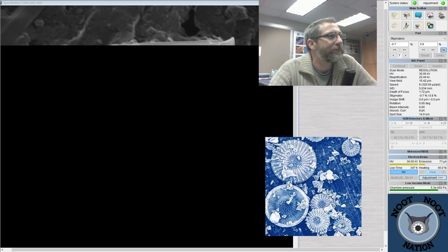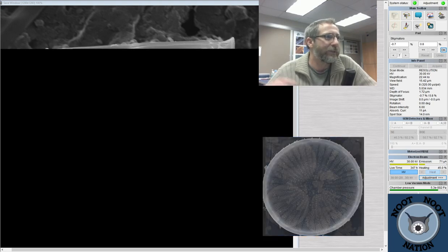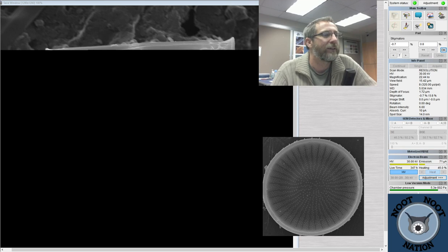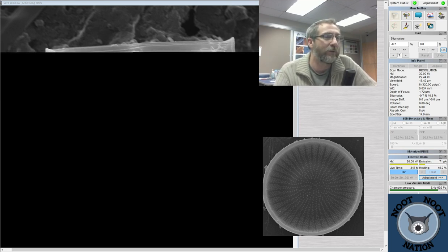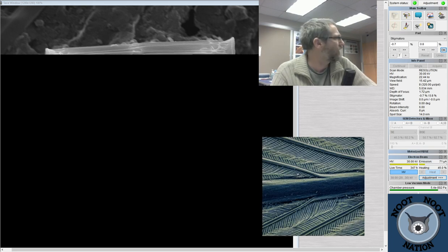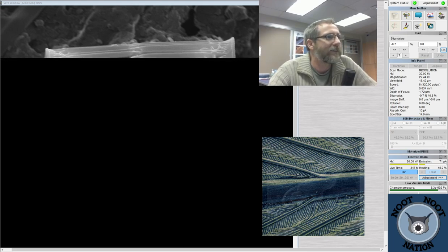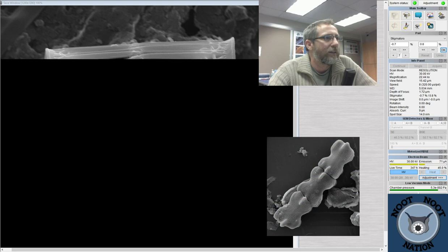Yeah, on the mail. Do you use gold to coat? Yes, I do. You carbon coat thin sections, because you don't want the gold contamination. Yeah. So when we're doing ours, if we're doing something that has gold in it, we sputter coat it with silver. I don't think that my sputter coater will do carbon coating, but you can use any metal really. So yeah, sorry, I got to that question.